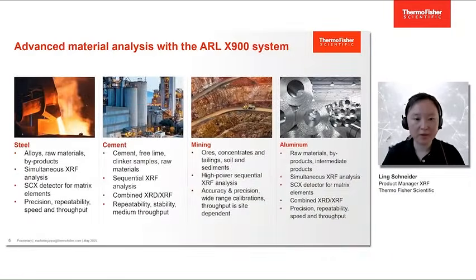In March and April, we finished the webinars focusing on applications of the ARL X900 spectrometer in steel and cement. If you have missed the first two webinars, please feel free to click the on-demand videos. Today, we will focus on applications in mining. The next webinar will be focused on applications in aluminum.